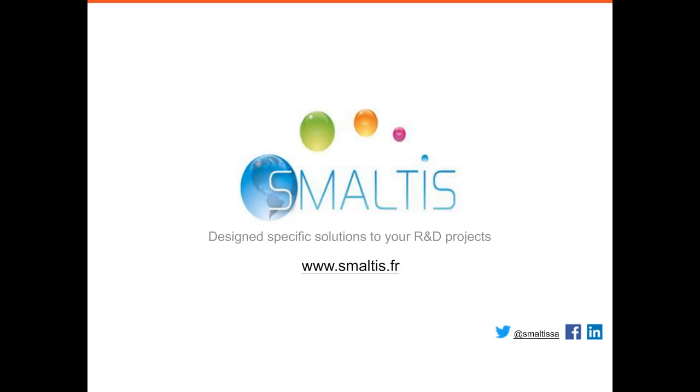Okay, next for you too. Does the Tecan software for monoclonality verification include an overview of all wells measured at a certain point in time? That question I need to answer with no, because we don't really have a dedicated software solution for monoclonality verification. As I tried to explain, we can offer a semi-automated approach.